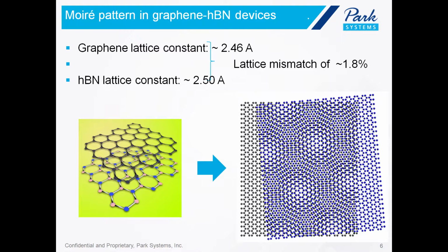By regularity, I mean the alignment of the graphene atoms on top of the HBN atoms. They're more in vertical alignment than they are in the borders of the honeycomb cells, the lines that distinguish the different hexagons in the superlattice pattern.